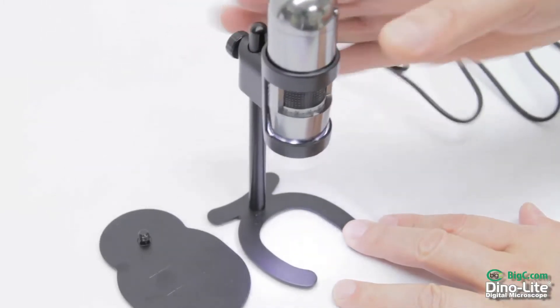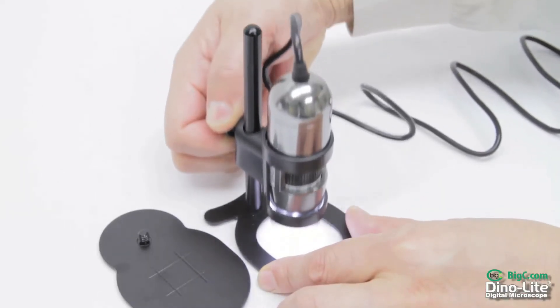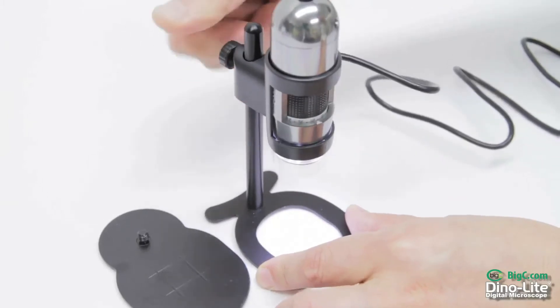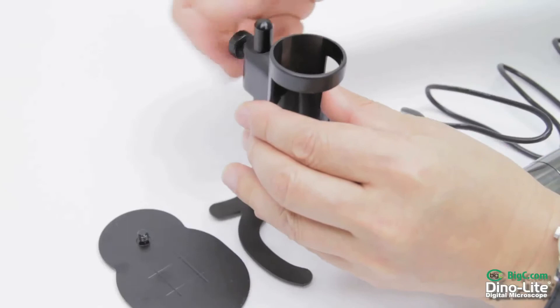Place your scope and set your desired height. Using a standard diameter female end, the MS-09B pole is also compatible with mostly all other tripod stands.